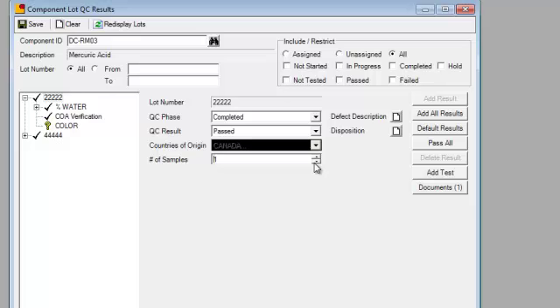And a metric that would make sense is show me the number of times that this formula is going through the lab each time we make it. If you get a higher than normal occurrence on a specific formula, then it might make sense to review that formula and make changes or tweaks to that formula.